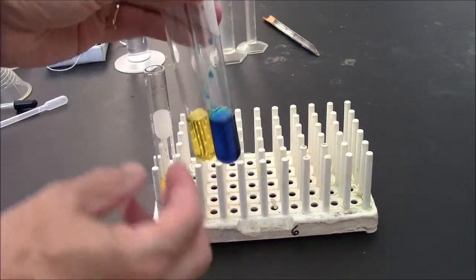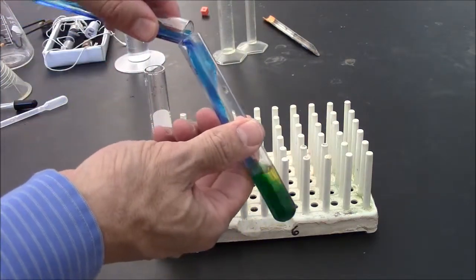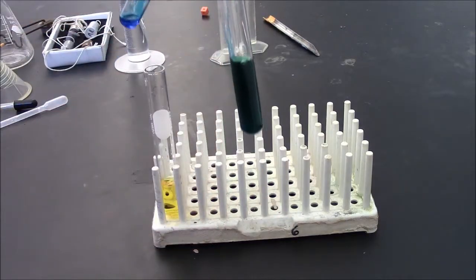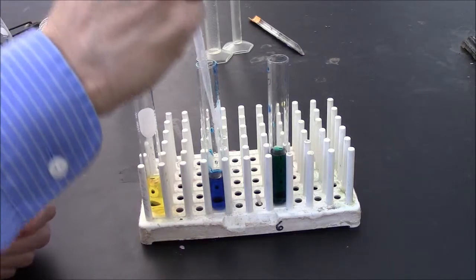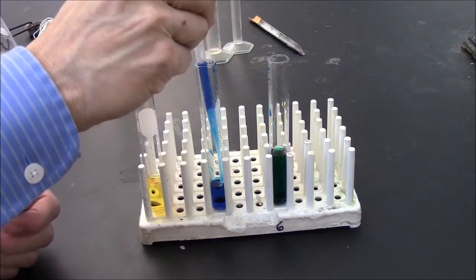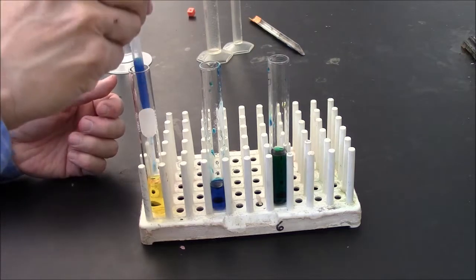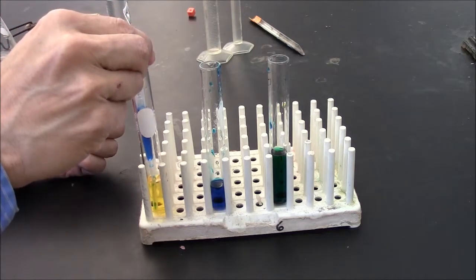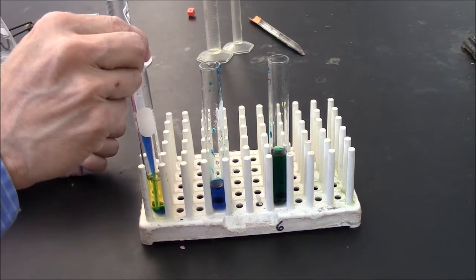If I were to just dump one into the other, they'll probably just mix. There we go. So if I want to make layers without mixing, I'll use this pipette and I'll carefully add my blue liquid to this other test tube.